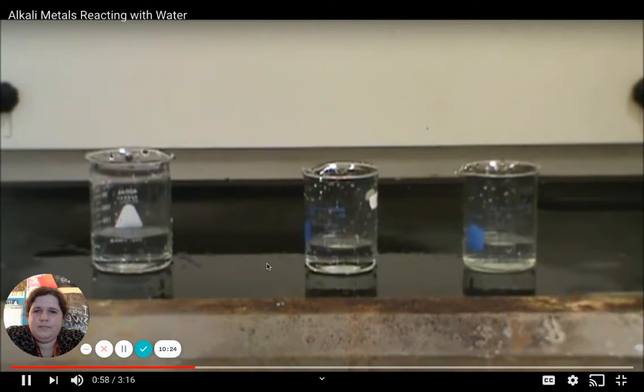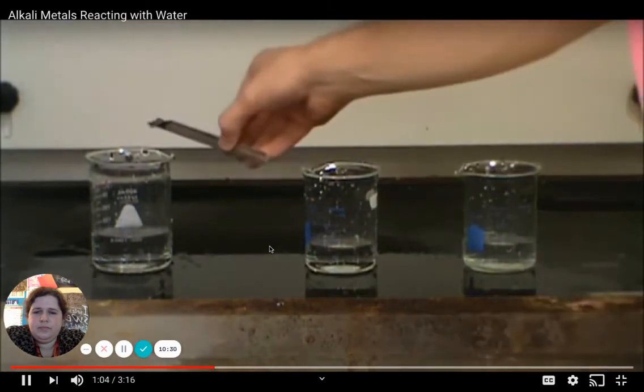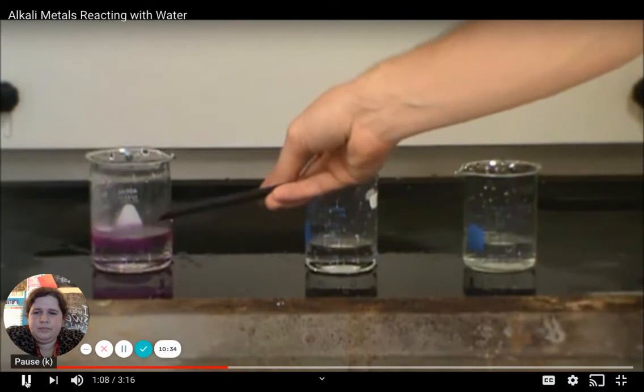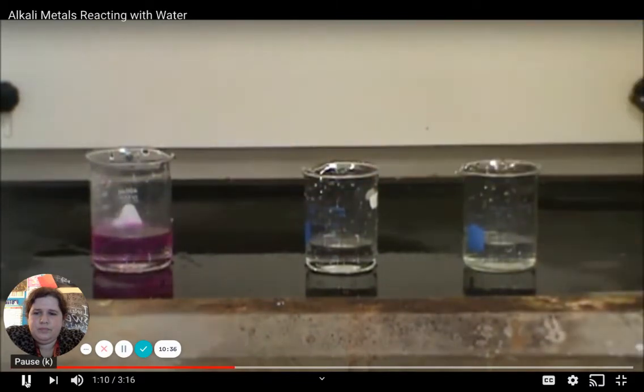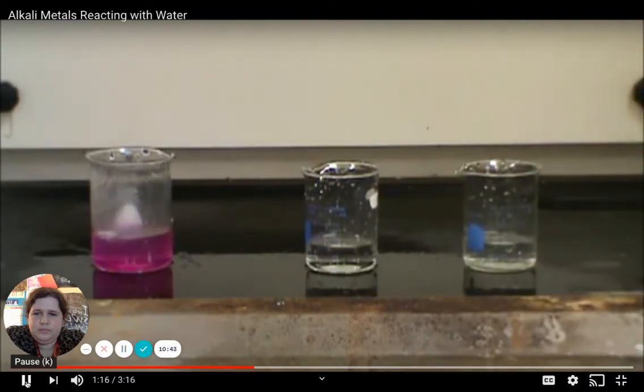So here I'm going to take the lithium, add that to the water. It's going to generate hydrogen gas and lithium hydroxide. So you're going to see a pink color develop here, and then you're going to see some smoke come off, and that's either lithium metal or lithium hydroxide coming off of there. Maybe a little bit of liquid water. But it's not as reactive as, say, sodium, so I'm going to put sodium into the next one.